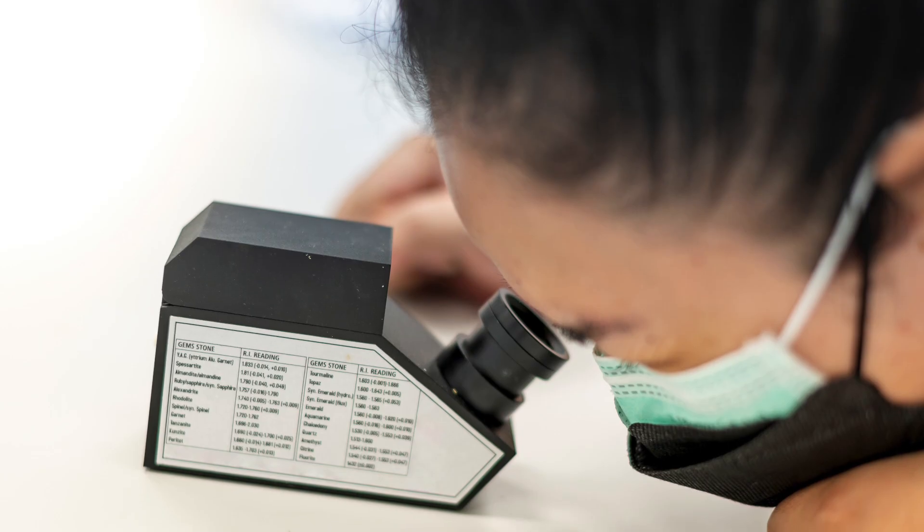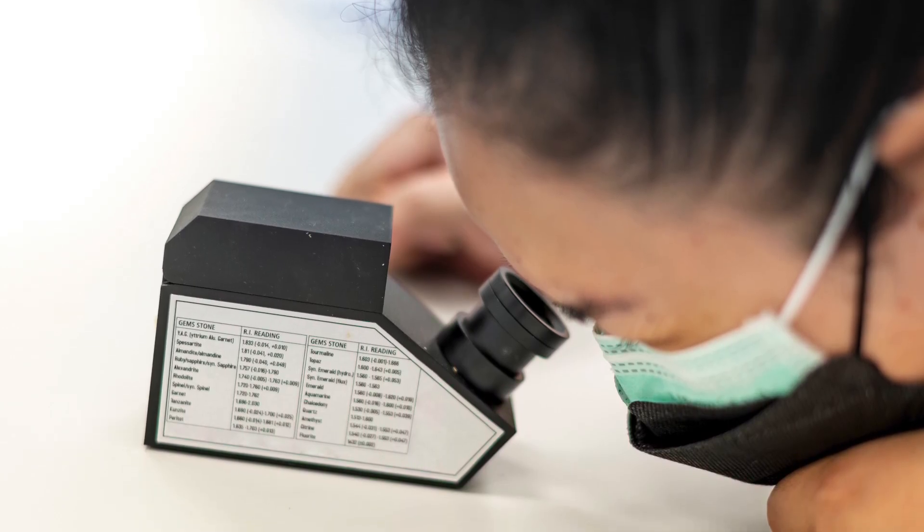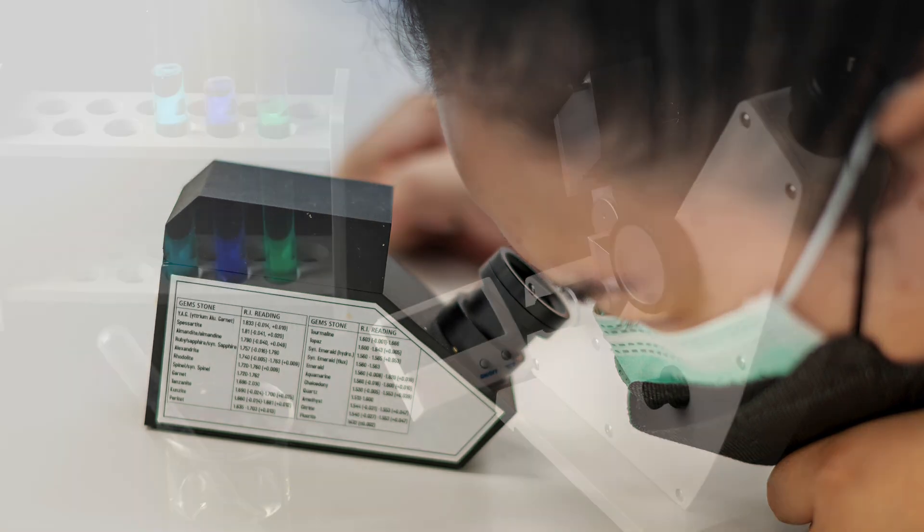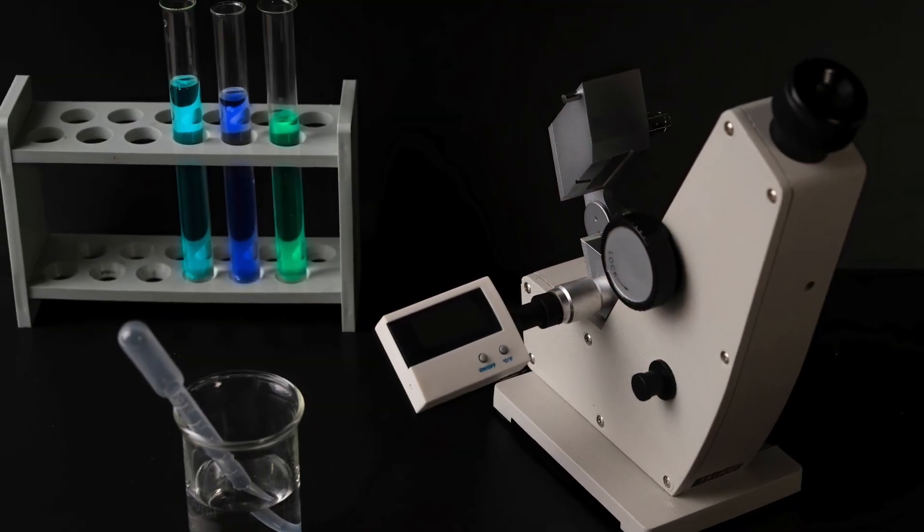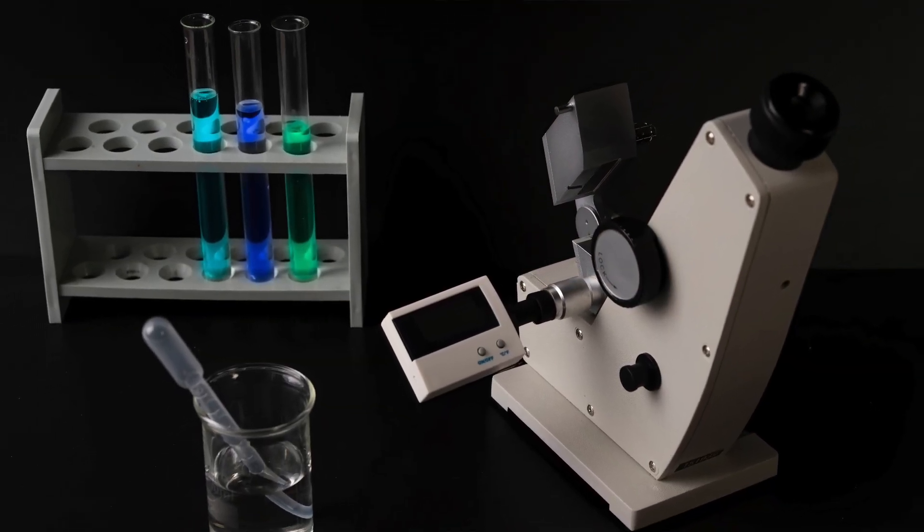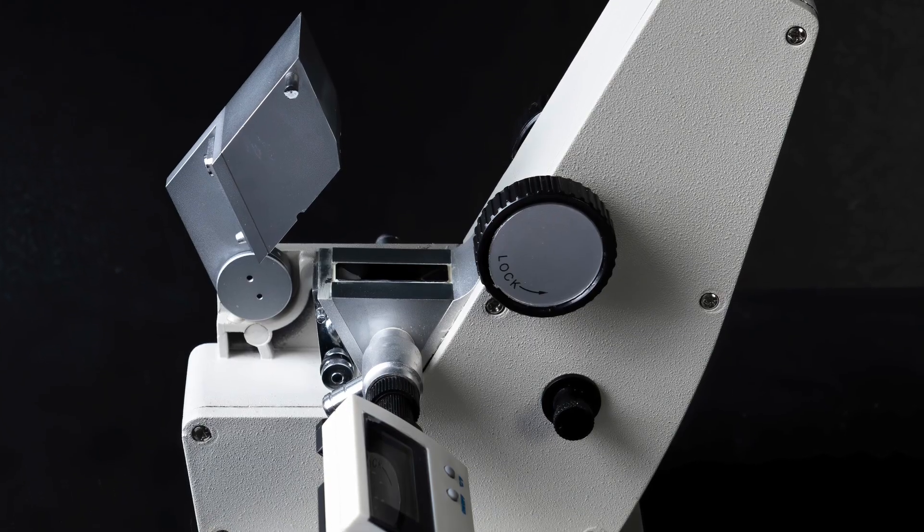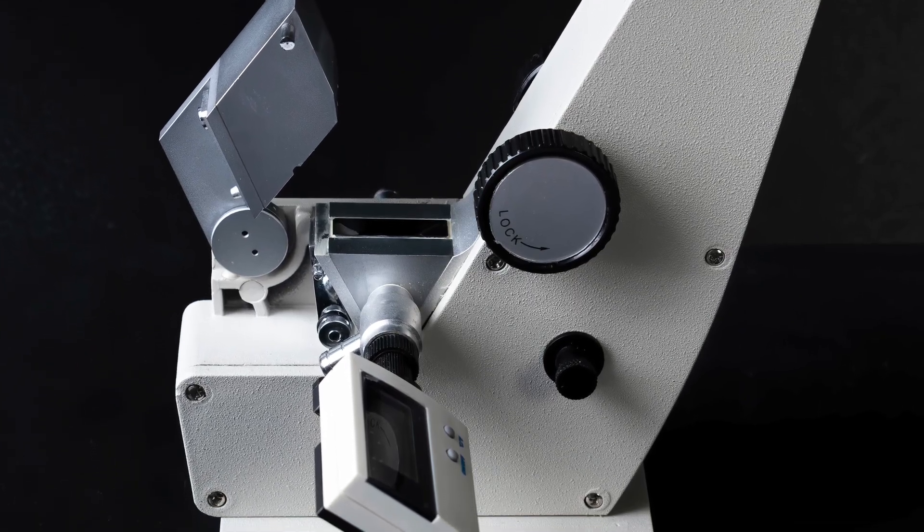Benchtop models are also available that automatically measure and display concentration readings. These units can help reduce the variability between measurements taken by different operators since the measurements are read electronically rather than interpreted by a particular operator.